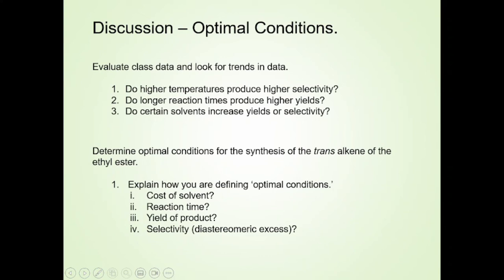But three people have ethanol for room temperature 15 minutes. The first isomer is somewhere in the range of 10 to 20%. Second isomer is in the range of 90 to 80%. And then there's one person that has them flipped. In that case, I'm suspecting the person that has them flipped probably did put them in wrong.